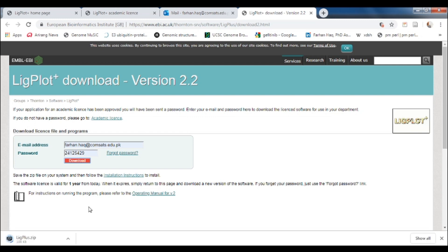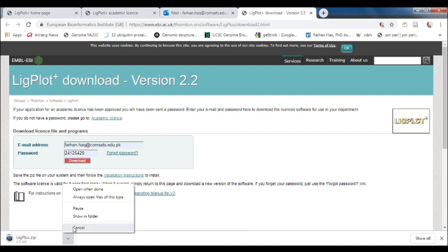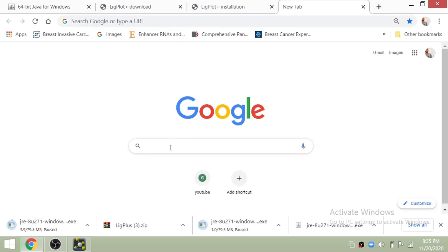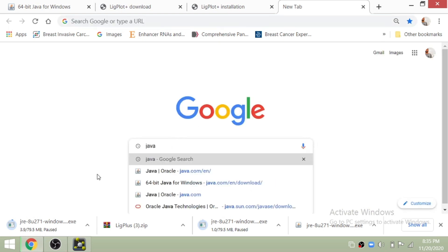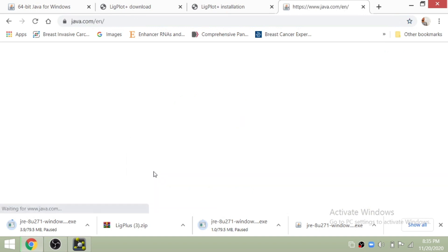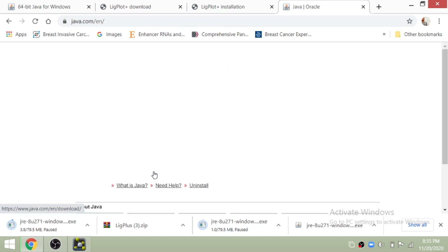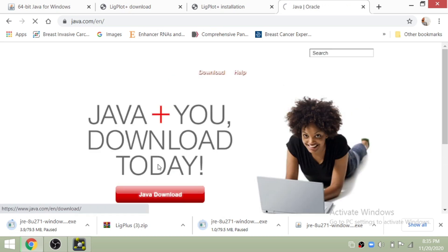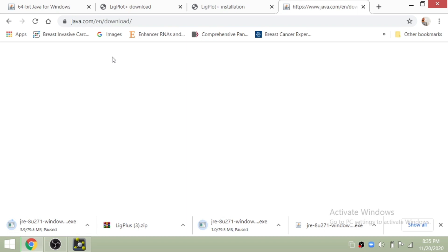After downloading LigPlot Plus, the next step is to install the Java library, which is also very important for LigPlot. Just search for the Java Oracle library and it will take you to the website where you can find the Java exe file to download into your computer.